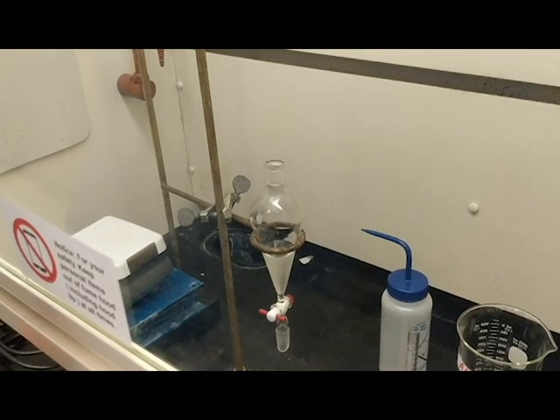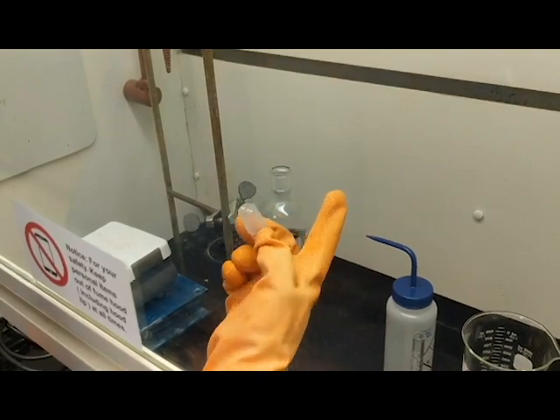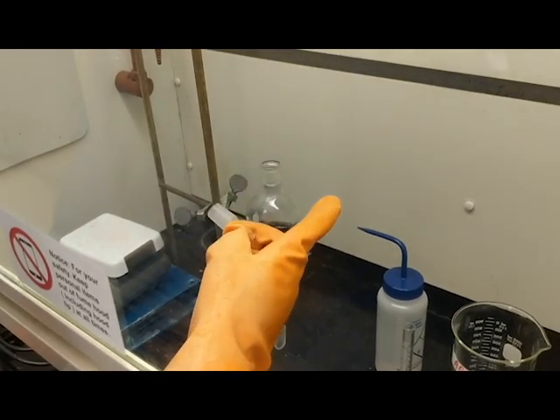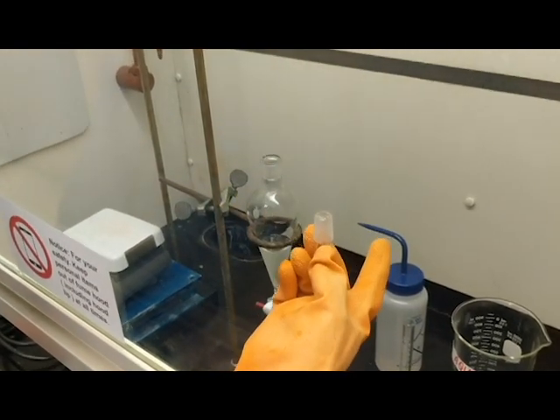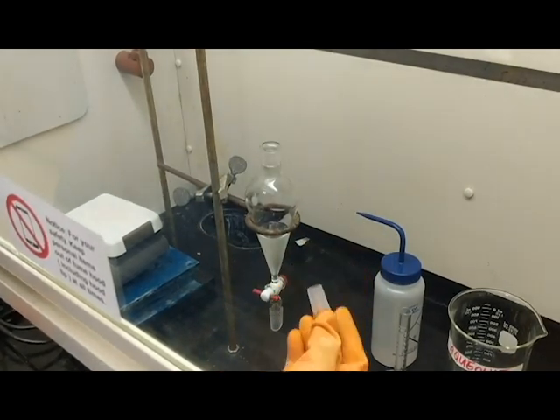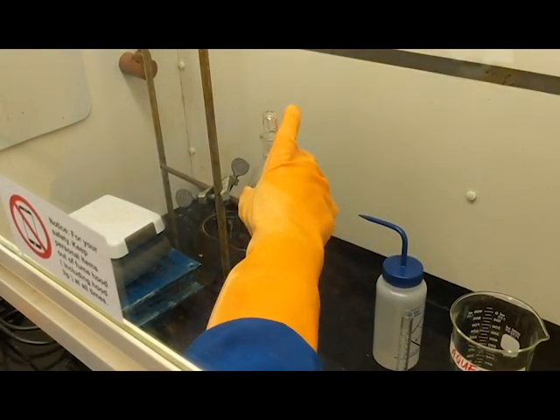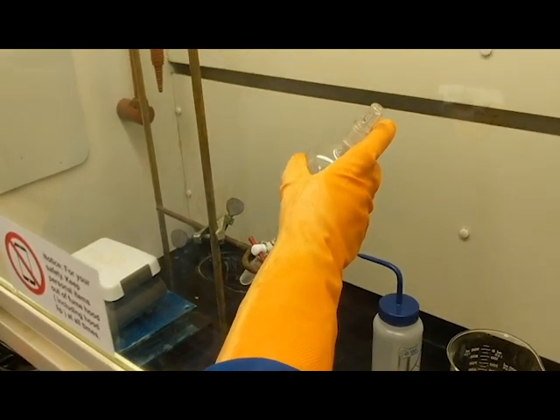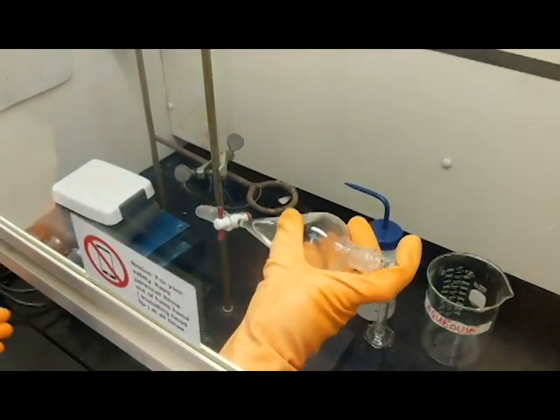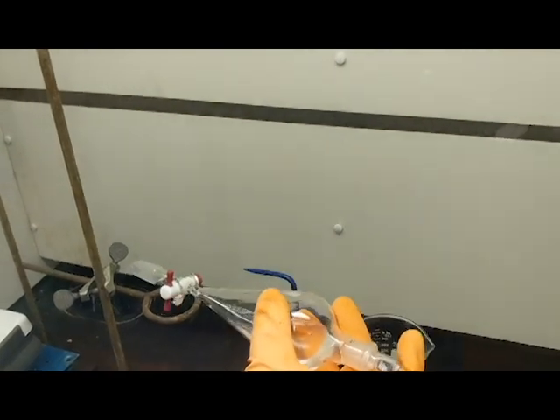So rather than allow the pressure to build up, I'm going to vent the cap facing the back of the hood. Not to my partner, not facing me, and not facing outside of the hood, but to the back. Should any condensation fall out during the venting process, it will splash towards the back of the hood where it belongs. So I'm going to put my cap onto my separatory funnel, and I'm going to slowly take it out, and I'm going to do this for 5 minutes. At this time, I'm going to rely on my assistant to tell me when that 5 minutes is over.